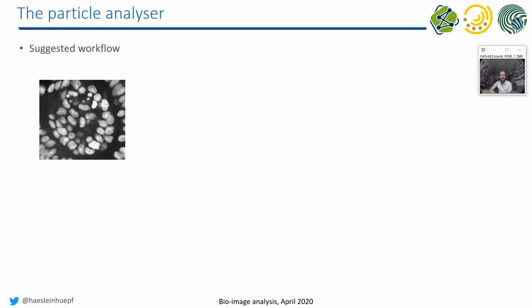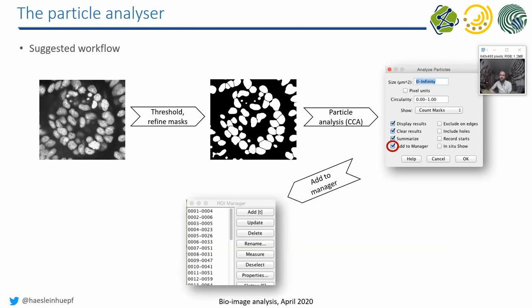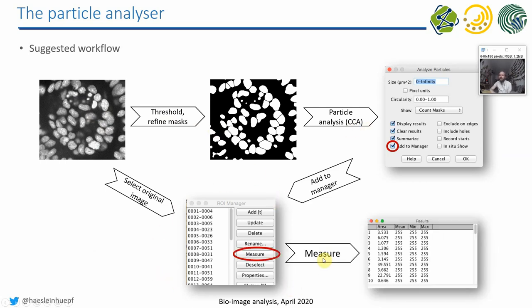So that's the suggested workflow. We go from the original image, we do some thresholding, we do particle analysis, and then we do an export to the ROI manager. And from that, we get a table by doing measurements.